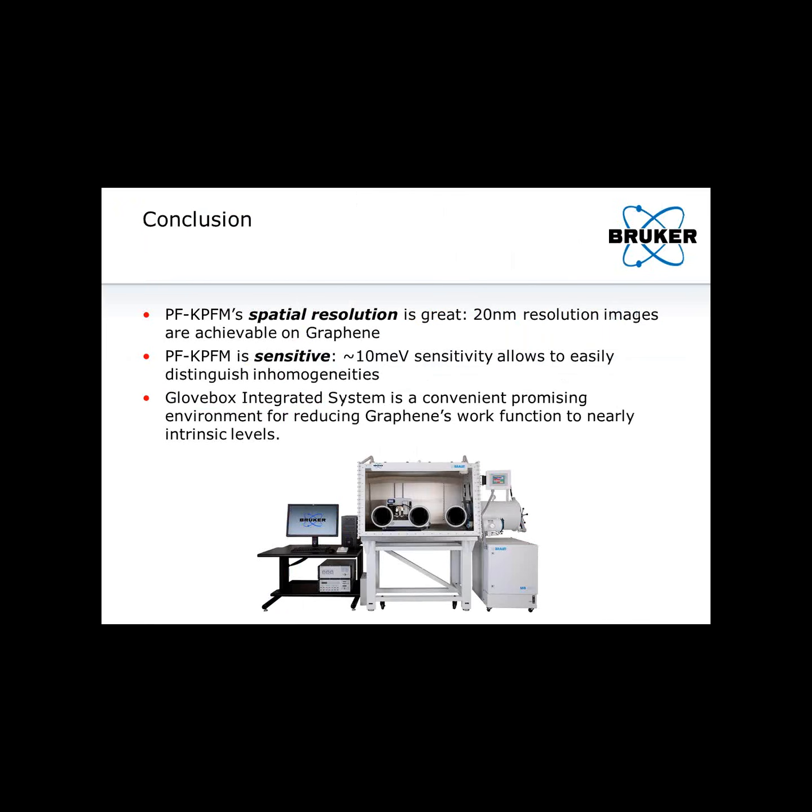So let me conclude the presentation. We have demonstrated that the PeakForce KPFM's spatial resolution is great. You can get 20 nanometer resolved images on graphene. We also show that it's pretty sensitive. We have 10 milli electron volt sensitivity that allowed us to easily distinguish the inhomogeneities in graphene. And we also showed that the glove box integrated system is a convenient, promising environment for potentially studying intrinsic graphene or nearly intrinsic graphene.